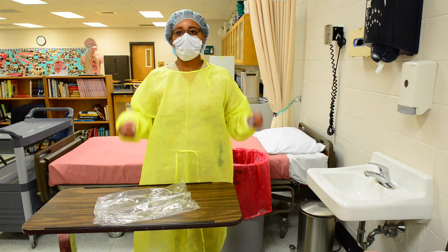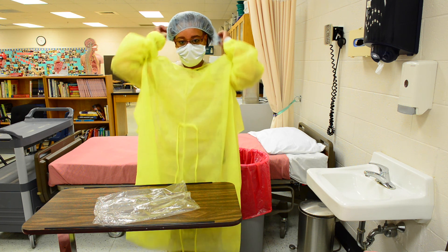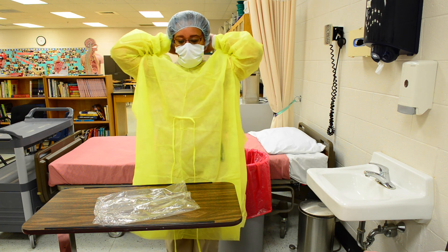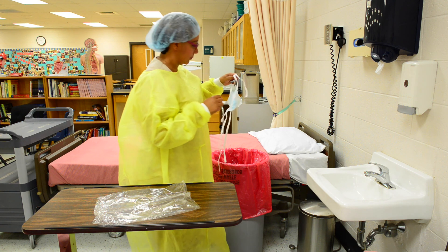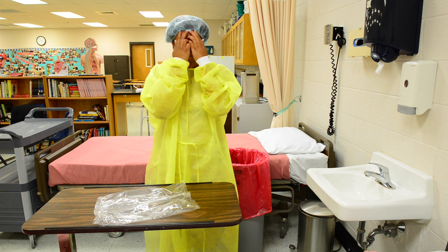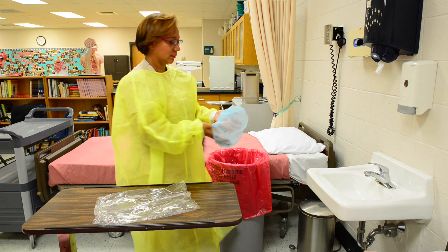Remove mask after gloves, handling only the ties. Place in infectious waste. Remove the head covering, making sure your fingers are underneath so your hands do not get contaminated.